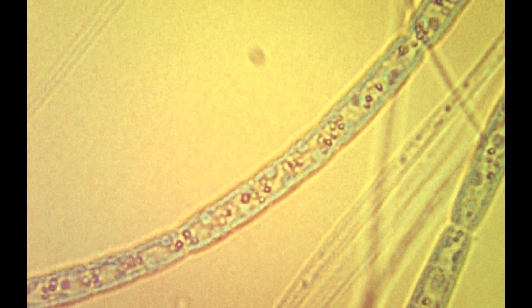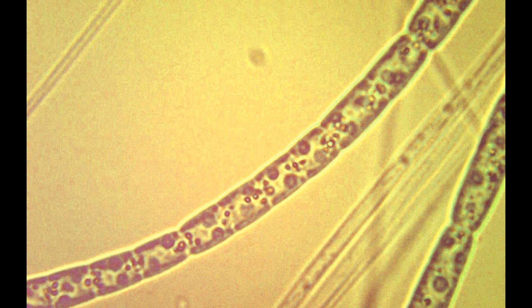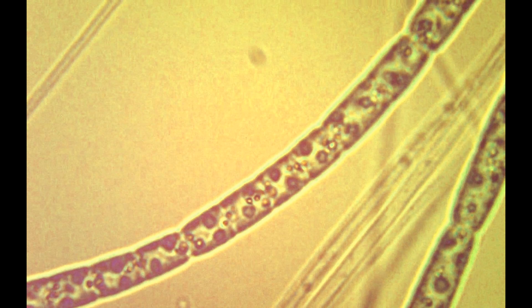This action is clearly a strategy this organism adapted in order to be constantly exposed to the nutrients in the water column. Taking a closer look, we can see the structures inside of the cell, most likely being nuclei and chloroplasts.